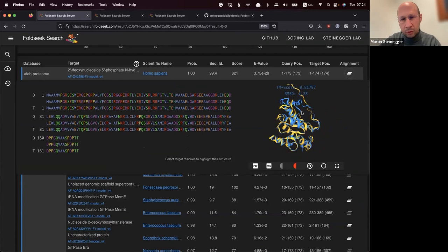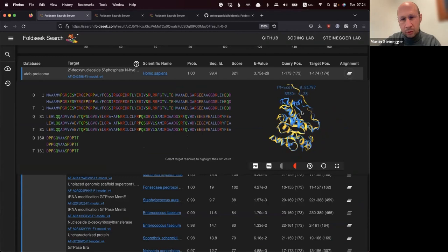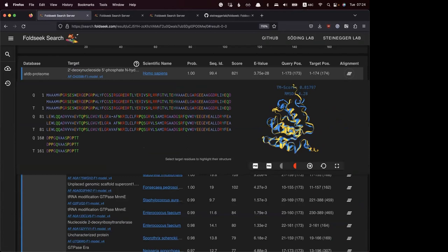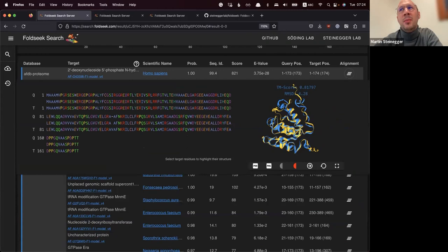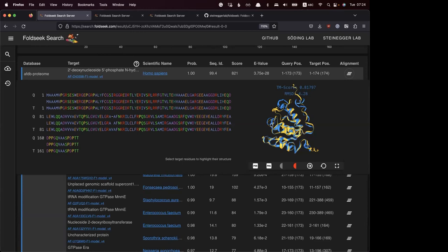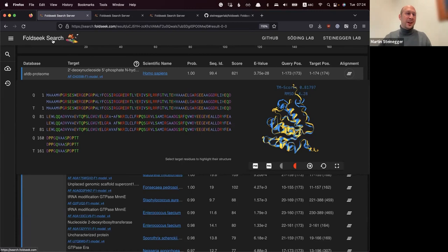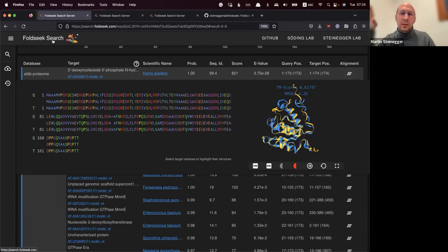Regarding specifying which chain to use when entering a PDB ID — we don't have that as a feature yet, but that's a good point and we should definitely have it. As I showed with 1TIM, the search separates results by chain, so even without specifying, you can click on the chain result you're interested in.